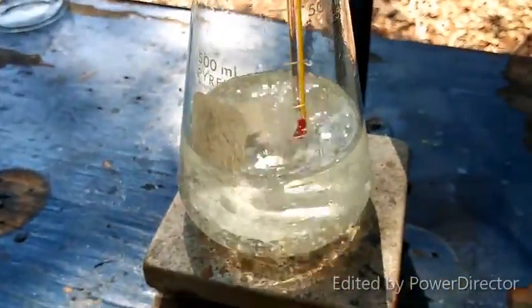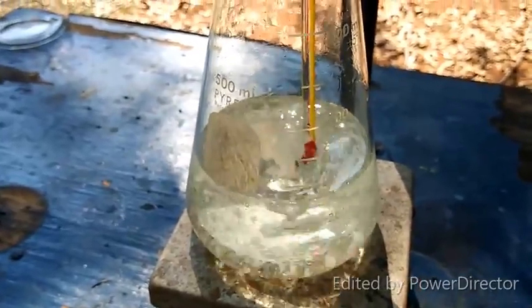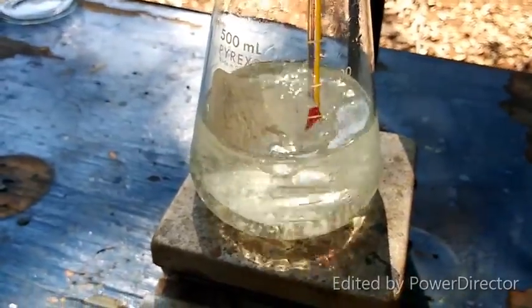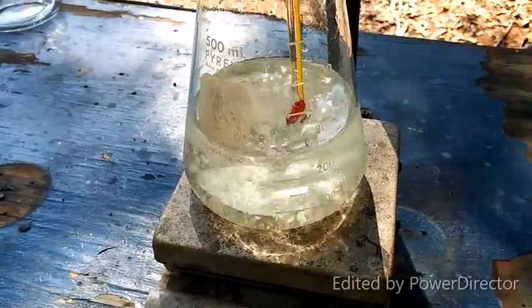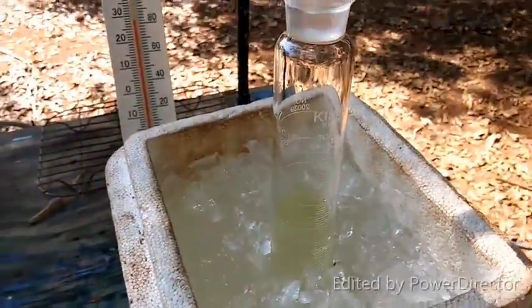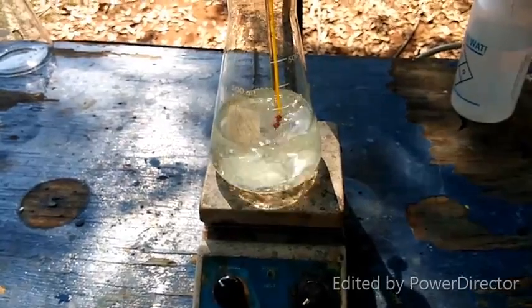It takes a long time to dissolve, y'all. And I really hate that it's getting so warm. But once it all does dissolve, although you don't see it in the protocol, ChemPlayer's tip is to chill this back down to 10 degrees C. So, again, sodium hypochlorite is nice and chilled. Once this is all dissolved, we'll take this off and cool this back down to 10 C.